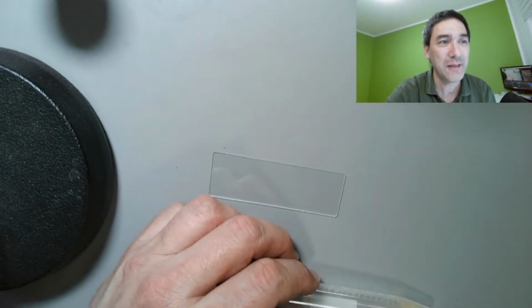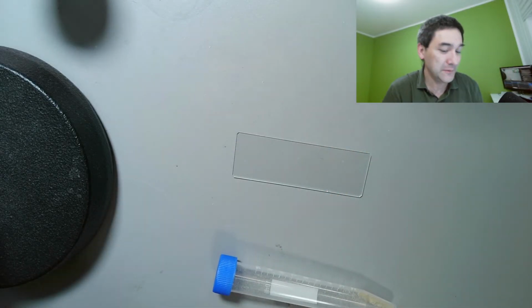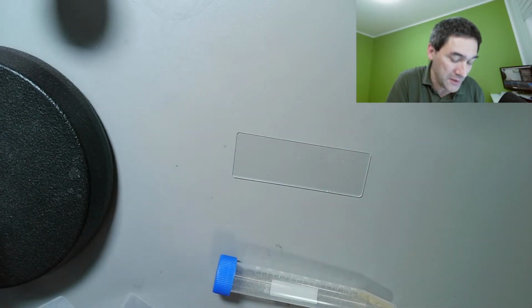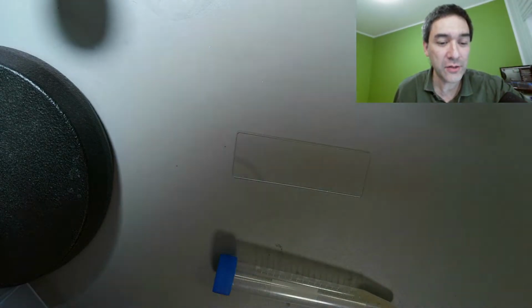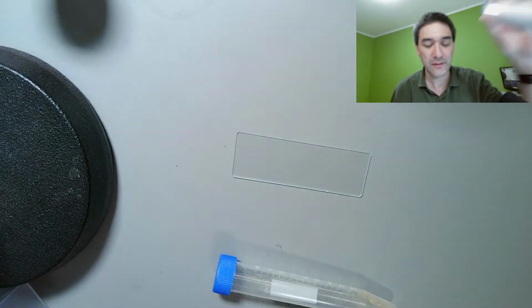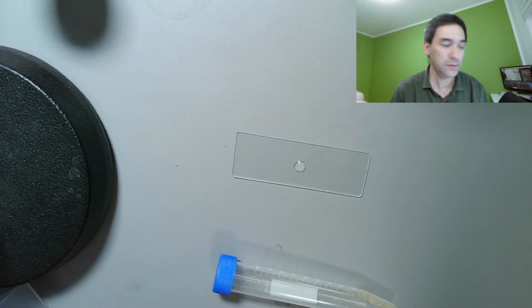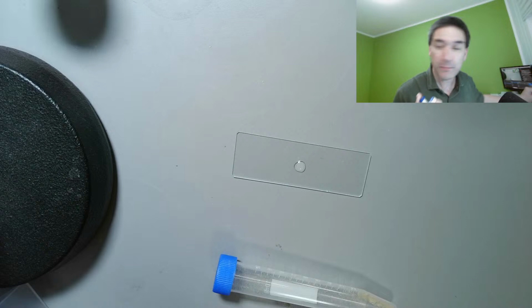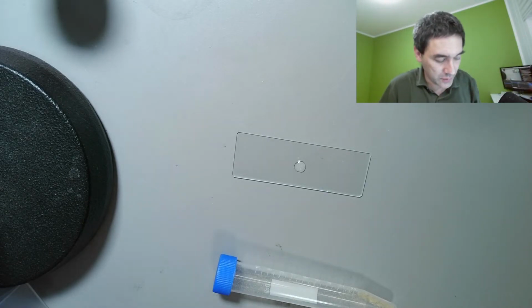Okay, now let me put this over here. I've got this other camera. So this is actually pretty straightforward again. I'm not going to make a permanent slide. I'm just going to take a little bit of water. You cannot see it, I've got a glass of water behind here, and here a small drop of water. I need some tissue paper for the remaining water.